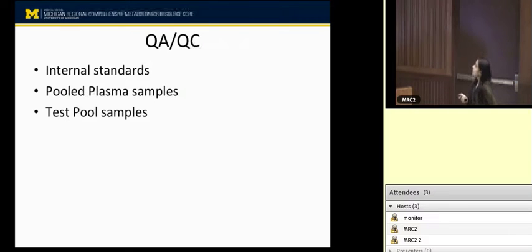The data processing workflow starts with the sample submission form. The sample submission form is filled by the client. They give all the information, factor information associated with these samples, and just a basic write-up about what they're trying to do with this. And once we get this information, sample information is uploaded in our LIMS system.